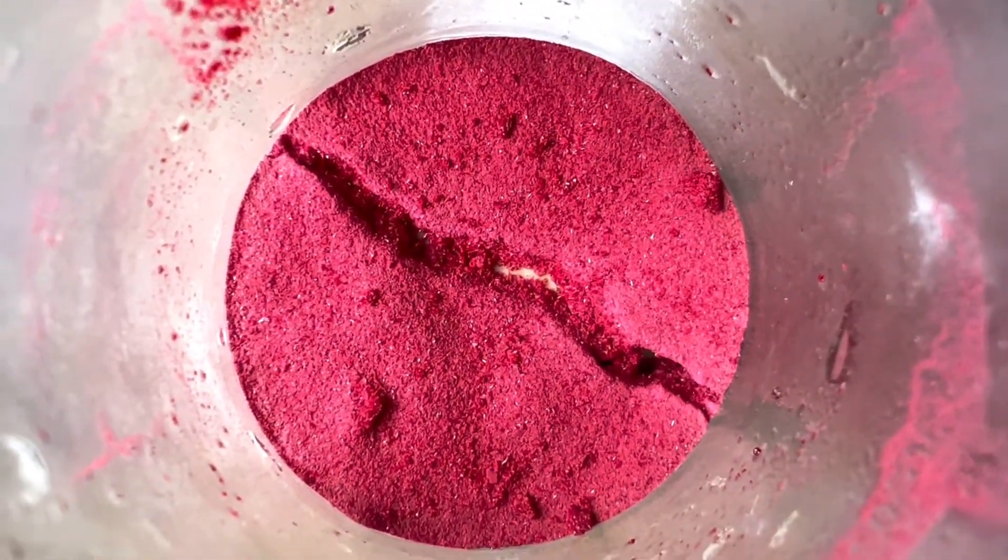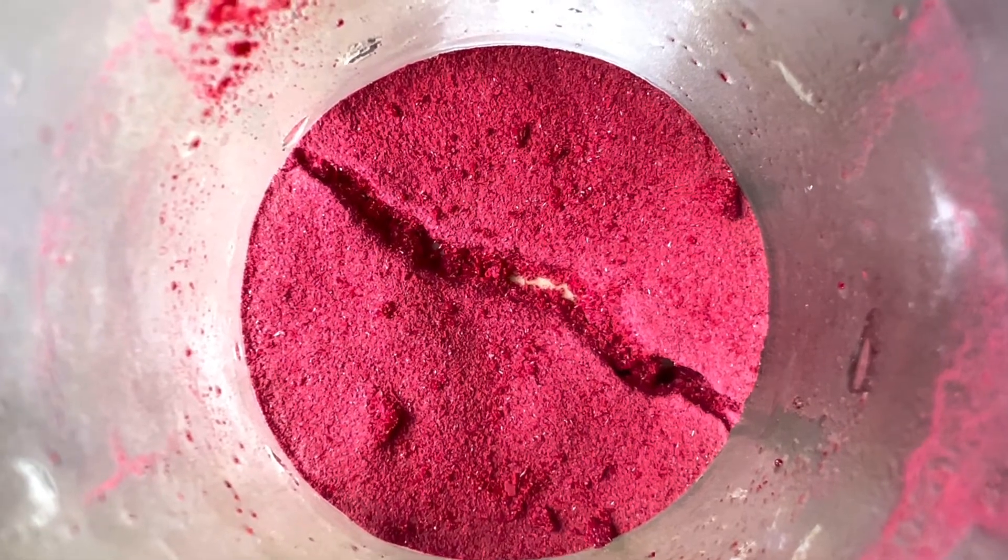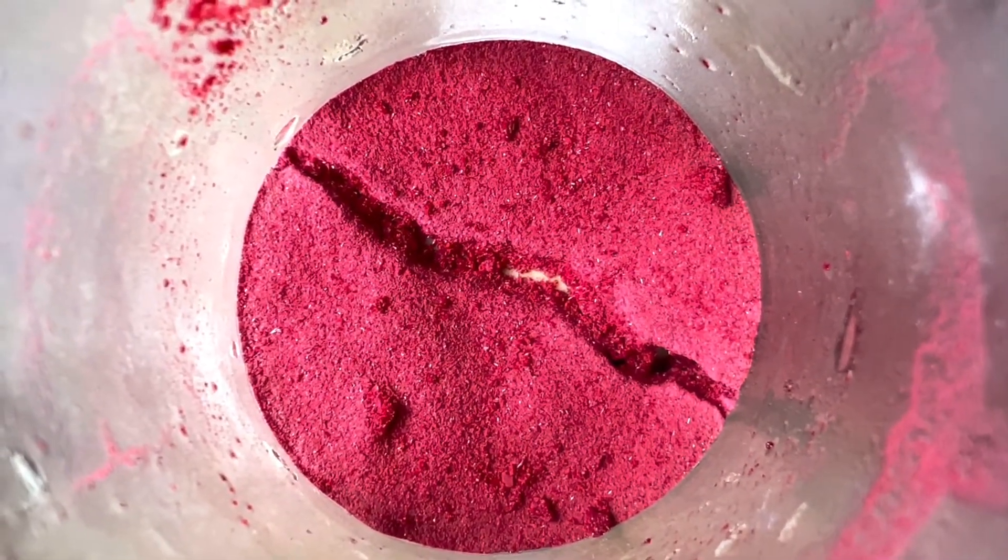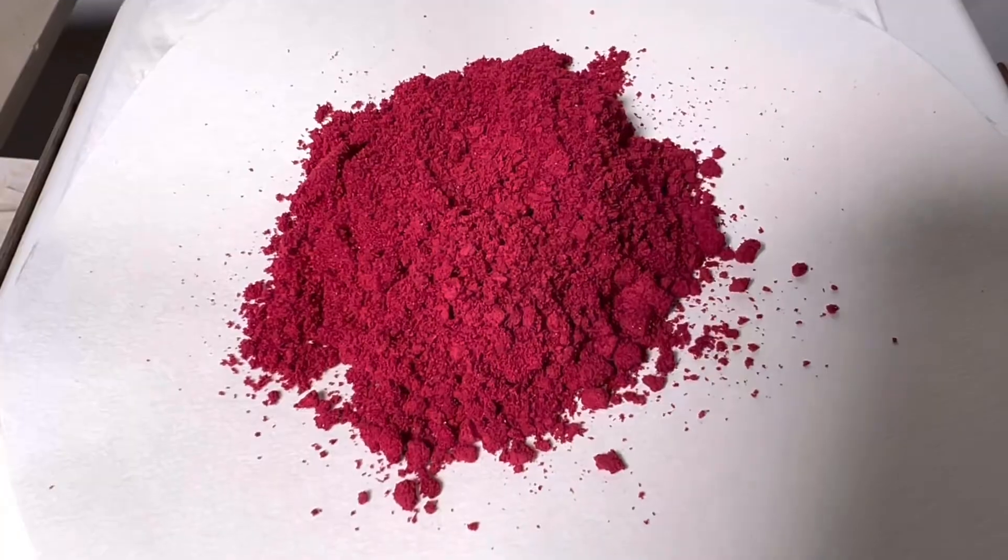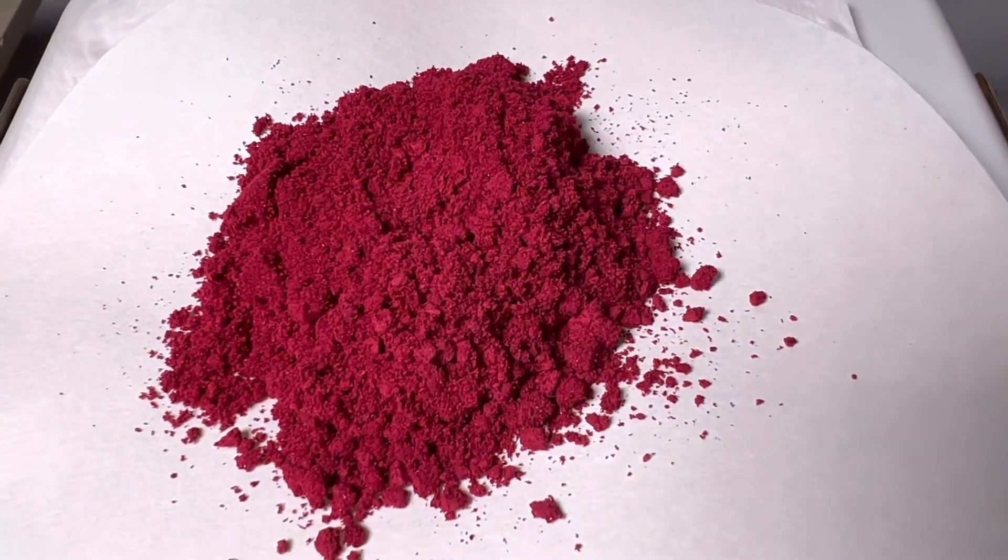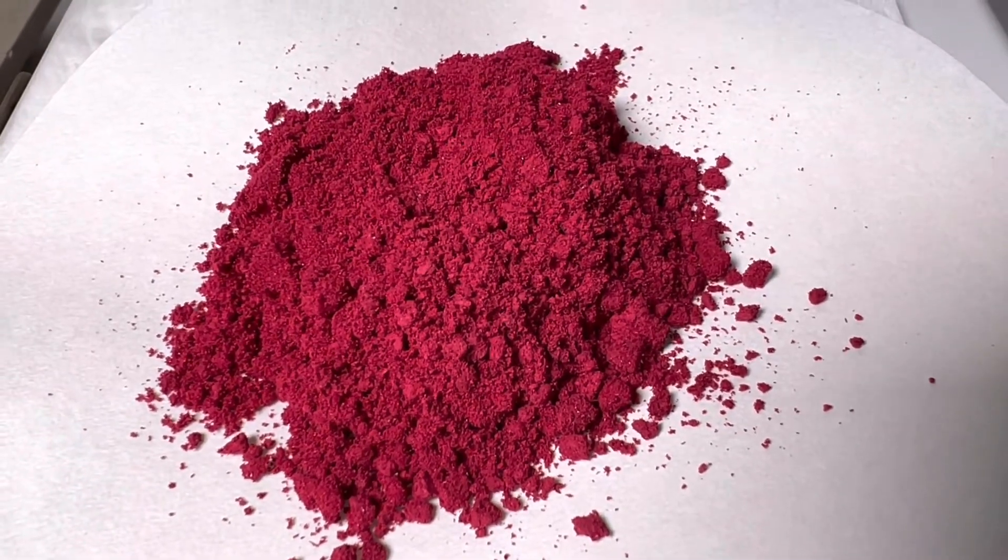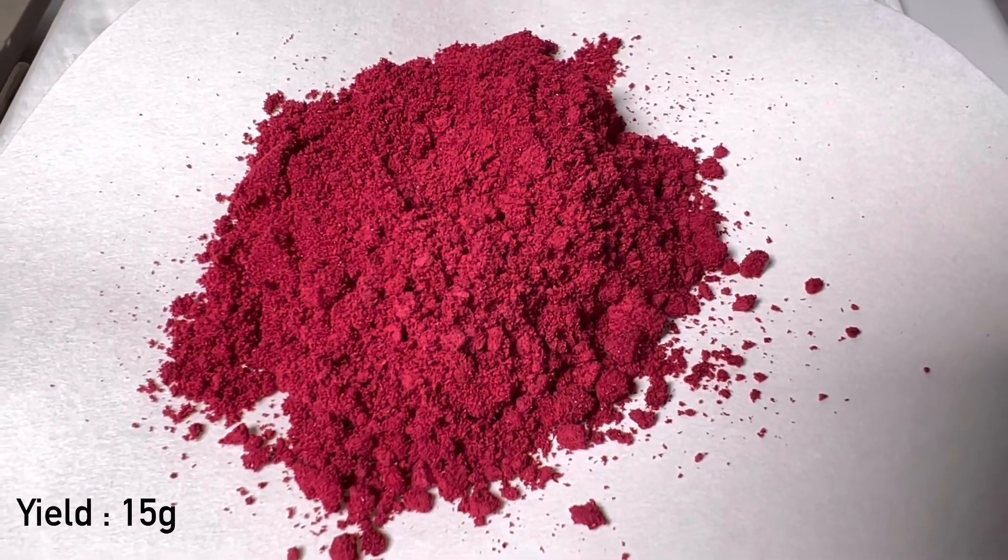The purple color of sodium violurate is now evident. For complete drying, the product was placed in a vacuum desiccator with anhydrous calcium chloride overnight. This is the final product taken out of the vacuum desiccator. The final yield that we got was 15 grams.